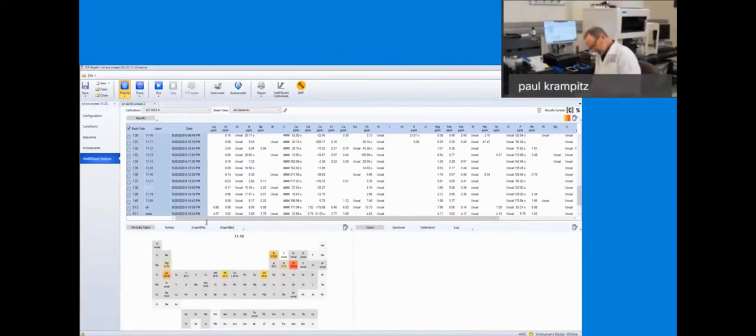And 1118 is, pardon me, 1118 is also railroad, but this is a front differential from a Kershaw machine, 4660 machine. So you can tell just by looking at it that it doesn't look like anything that I've seen in the wear metals.